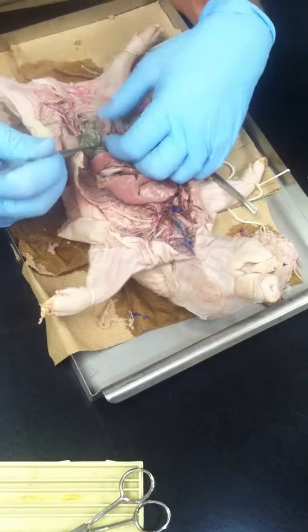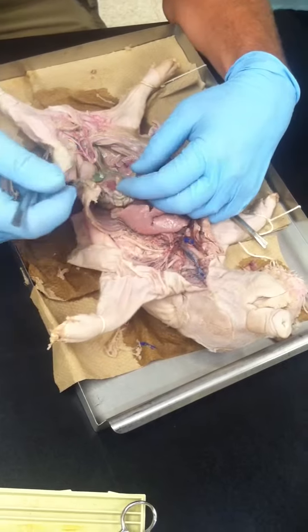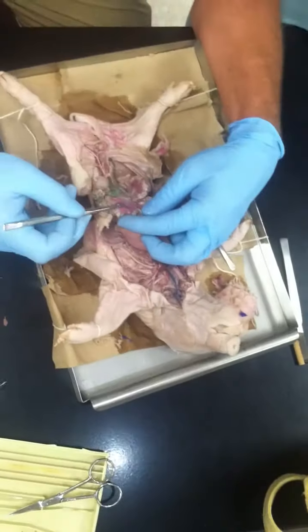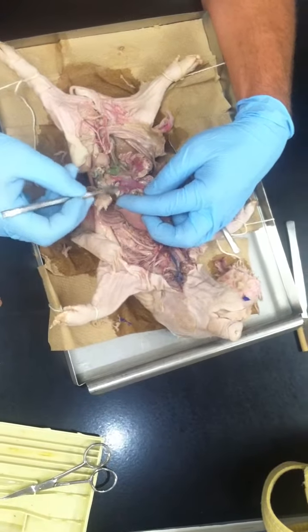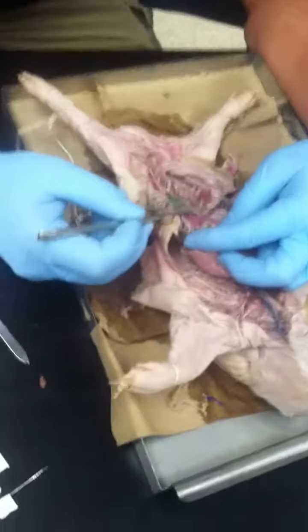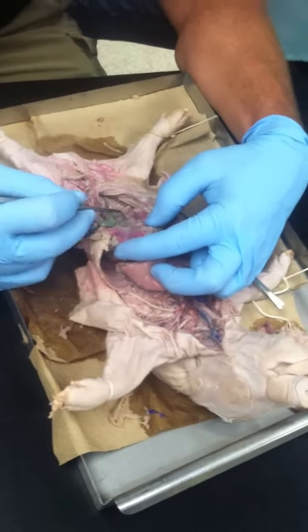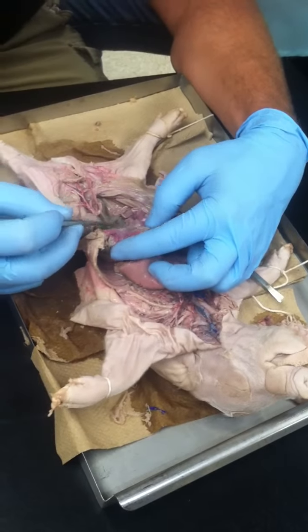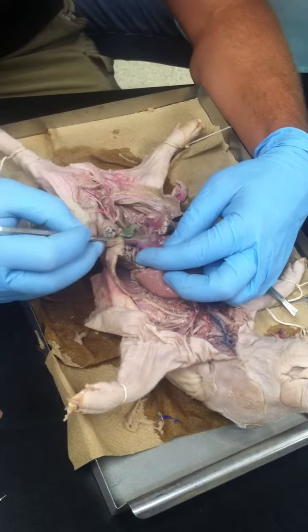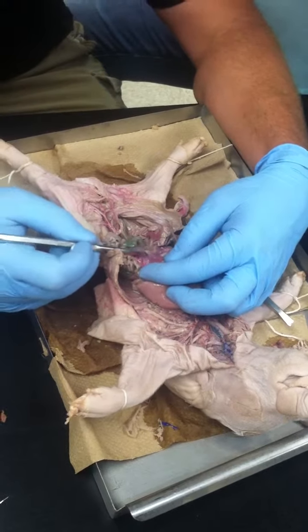All right, now down to the mesentery. You have the mesenteric. Where I'll label it is right through here. So you get down to the small intestine, you have this nice looking fan pattern here with these vessels. I'll just label it there. Really more accurate would be down, oh, this is a nice pig. More accurate would be right there. But I told previous people I just label it up there, even though that's something different.